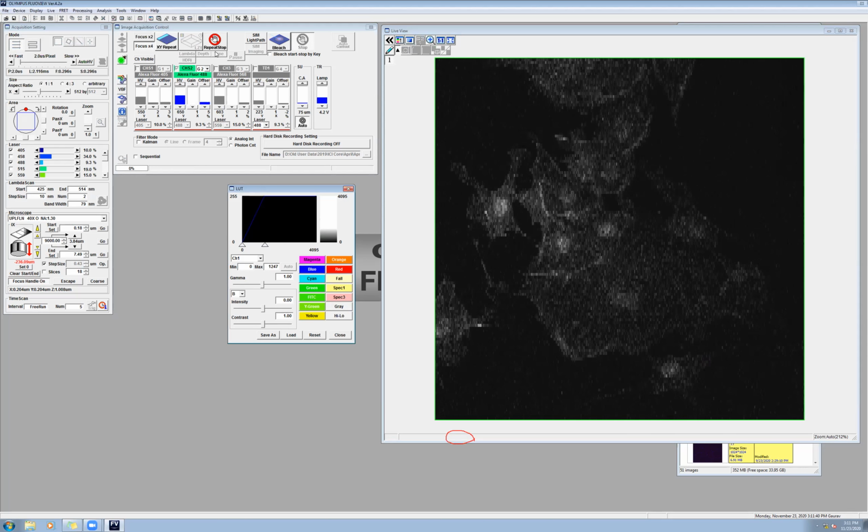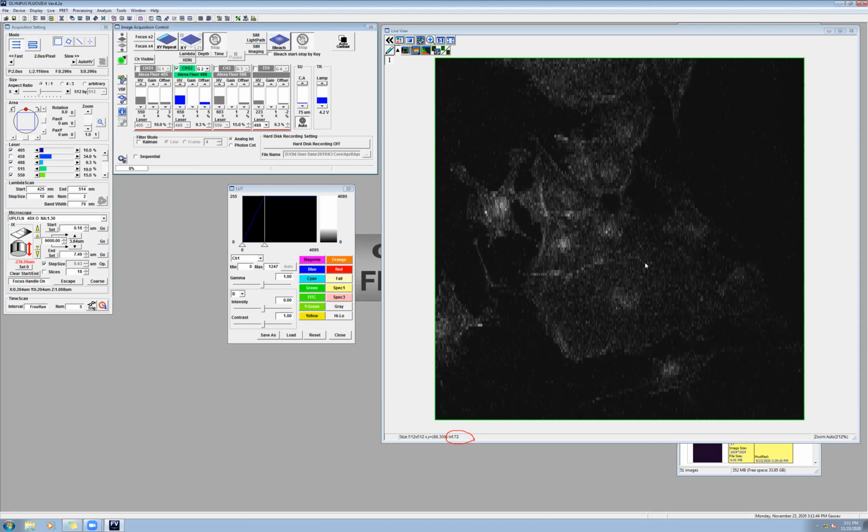But I know that I imaged this sample a lot, and that's why it's looking like this. The sample has been bleached, which is what I know. So what I will do is I'll probably bring this up to about 10%. I can either go to a different field or we can just play with this so that you know how bad things can look. Okay. So let's just play with this area.